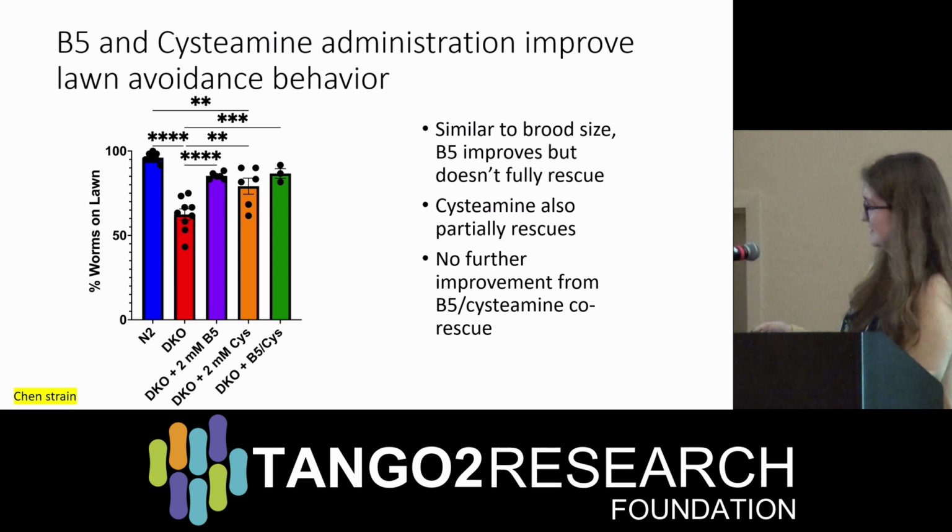When we give them cysteamine, that also helps them stay on the lawn a little bit more, but then giving them both B5 and cysteamine doesn't make that significantly better. So they're still not quite where we would want them to be.